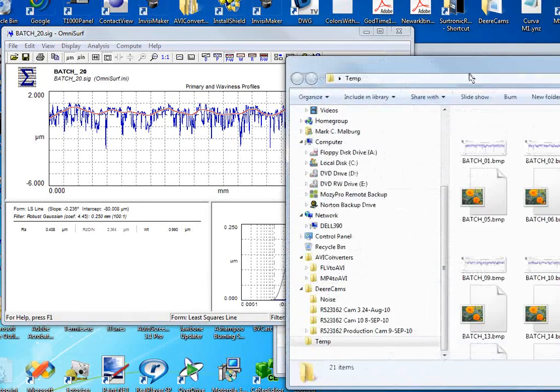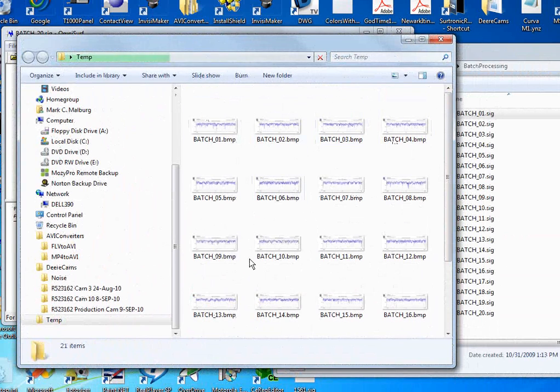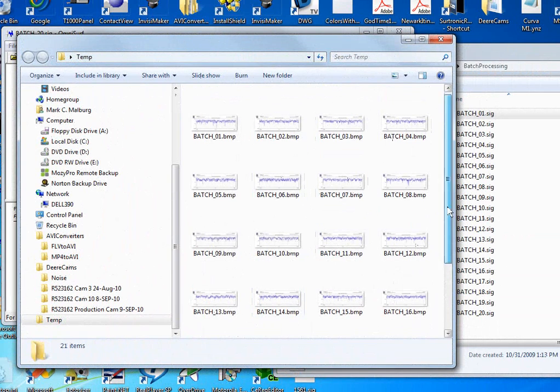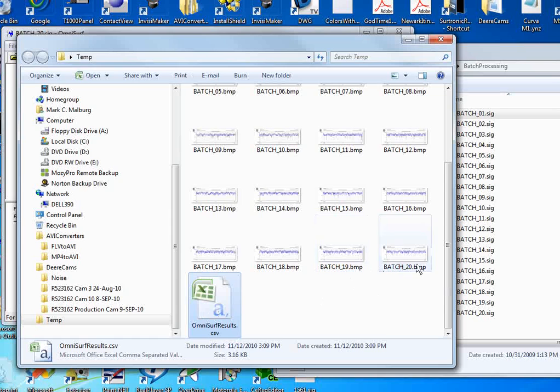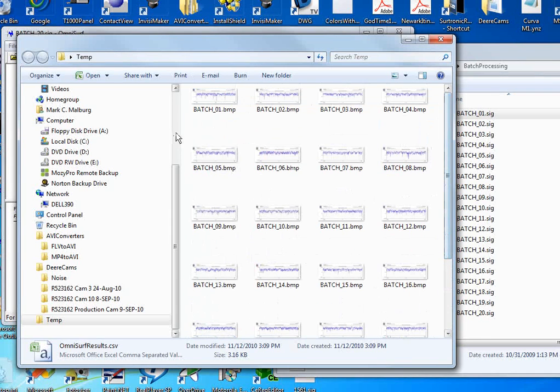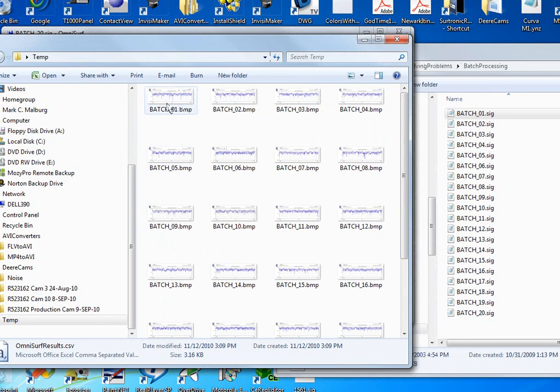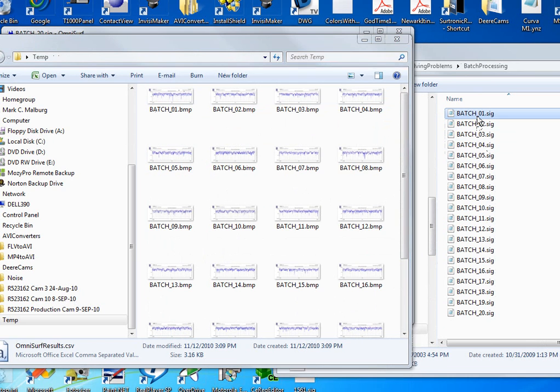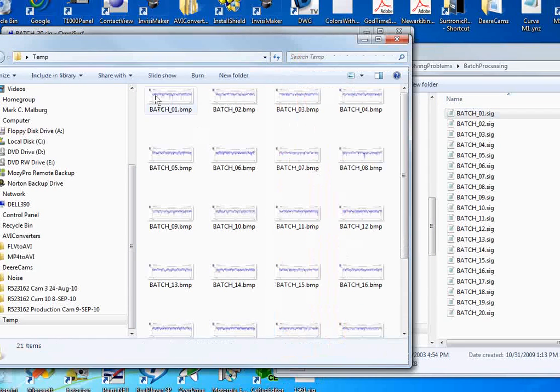In my results folder now, all of the images of the profile graphs have been created along with my standard OmniSurf batch process results of numbers. And you'll see here I have a file batch 01 bitmap that relates to the batch 01 SIG data file.